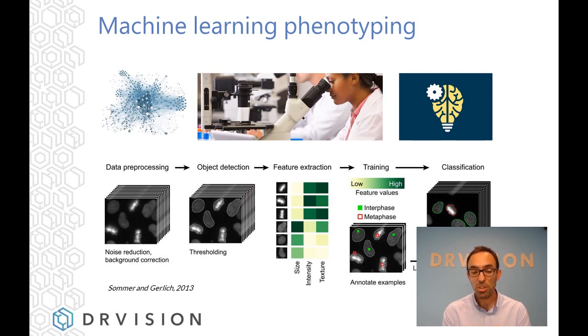What Aivia will also do, upon teaching, when you show Aivia that this particular neuron is of a particular class, is look at and extract a number of features. And features aren't really just measurements. They aren't diameter, for example. Features can be to do with the size, the intensity, the texture, and relationships between the size, intensity, and texture. So let's say we have 10 measurements. We might have 100 features for those 10 measurements, because they are combinations as well.